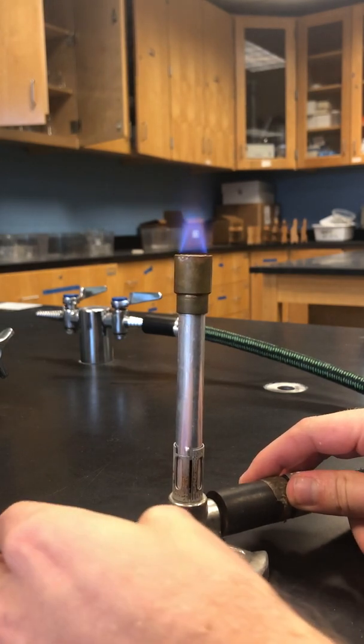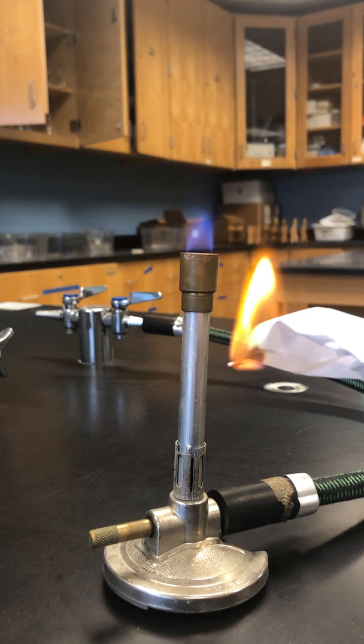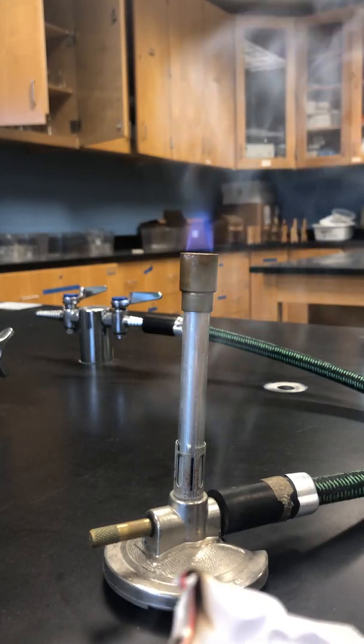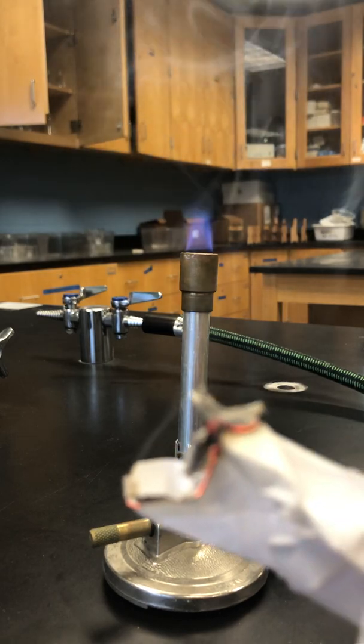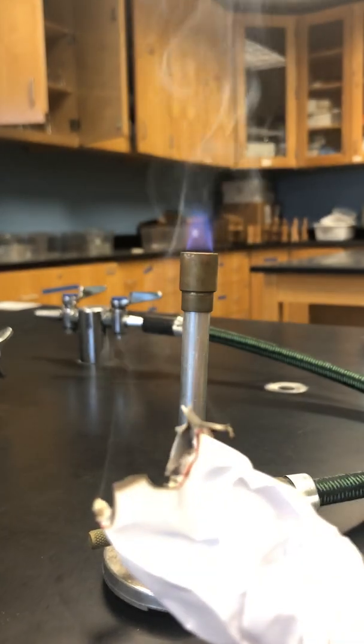So that little flame right there, that burning, how does that tell us that a chemical change is happening? Well, there's a couple of different ways. Flame, light, and heat are all being produced by the chemical reaction, just as if I was to take a little piece of paper and burn it. It's a chemical reaction. I can tell that because a gas is being produced, there's an unexpected color change, and there is flame, light, and heat being produced as well. Any of these things is enough to tell us that a chemical change is happening.